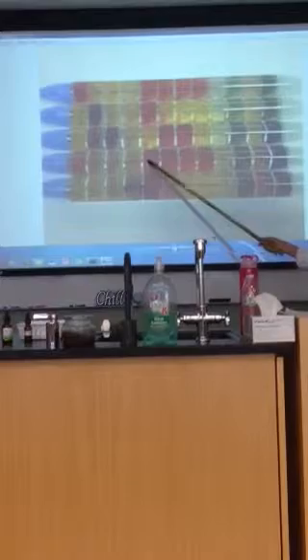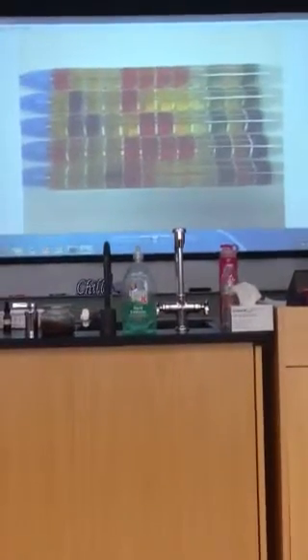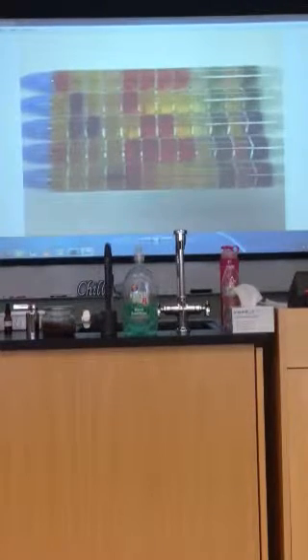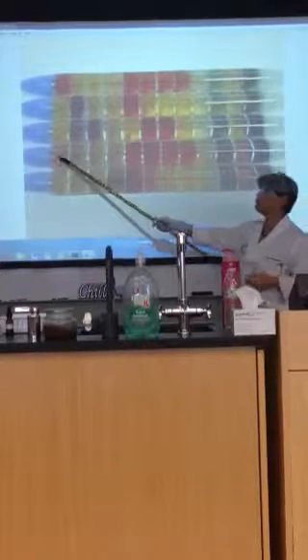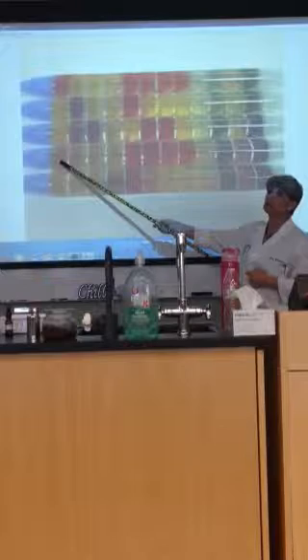This one is Pseudomonas aeruginosa, who requires air and can't ferment anything because it's not a fermenter, it's an aerobe. Does not ferment glucose. So right away I know this is not a facultative anaerobe.